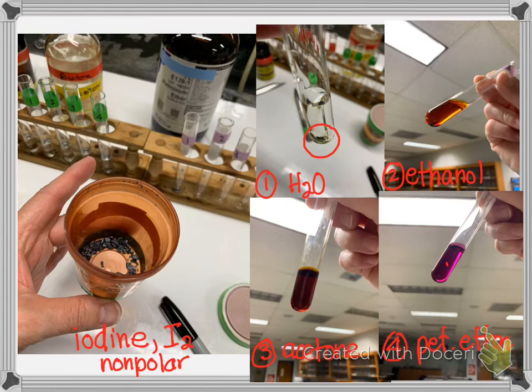So as you go back and look at the results, and you can go backwards if you need, what you're trying to do is record if the solutes were soluble or insoluble in each one of the solvents. Keeping in mind the rule like dissolves like, which means polar substances will dissolve other polar substances, and nonpolar substances will dissolve other nonpolar substances. However, polar substances and nonpolar substances will not create a solution. They will not dissolve each other.